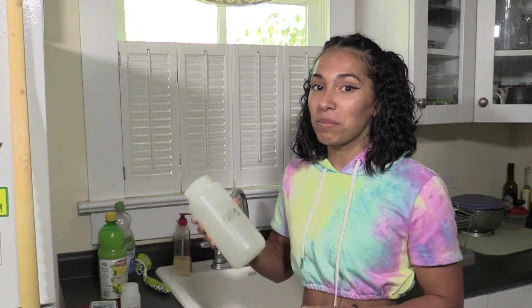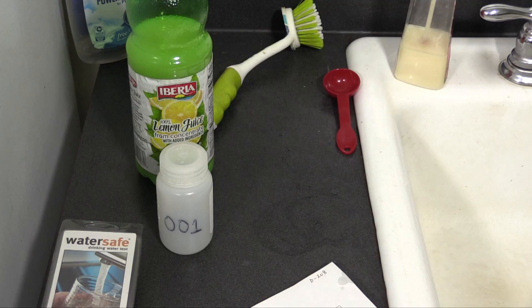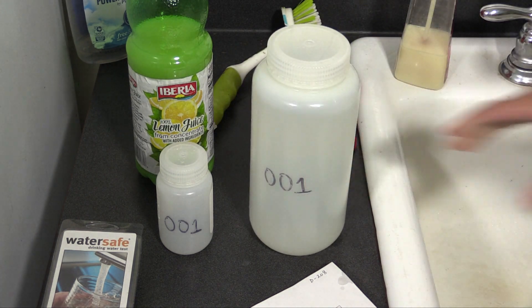Put the cap back on and shake for about ten seconds. But don't open up that test kit yet. The water you collected, along with the lemon juice, needs to sit for about 24 hours.